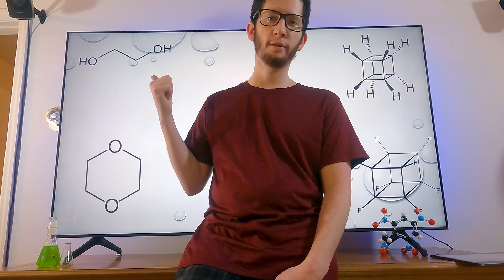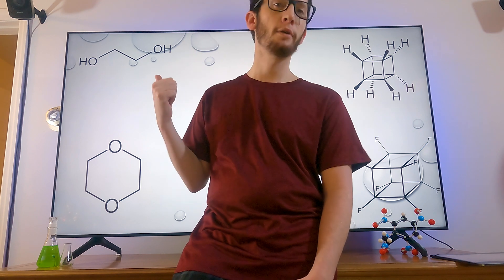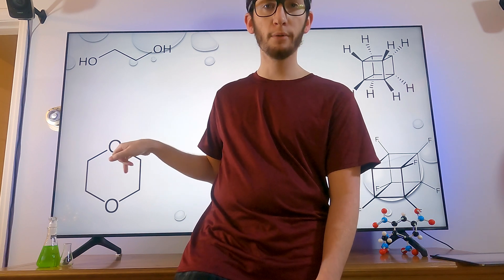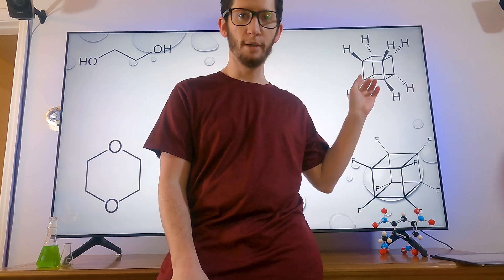So today we're gonna be isolating some ethylene glycol from antifreeze — and I accidentally bought the 50/50 because I'm stupid, so buy the non-diluted version. Just very simple distillation. We're gonna need to get some of that to make some dioxane. And then we are going to make this over here: cubane. Eventually.